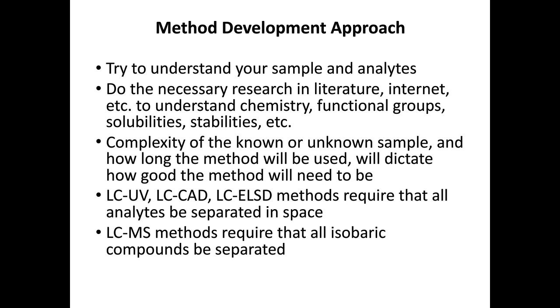The complexity of the known or unknown sample will dictate how long the method will be used, and how good a method you need to develop. Will it be used in one laboratory? Will it be used in your own laboratory and transferred to multiple ones in your own company? Will it need to go outside of your company or around the world?